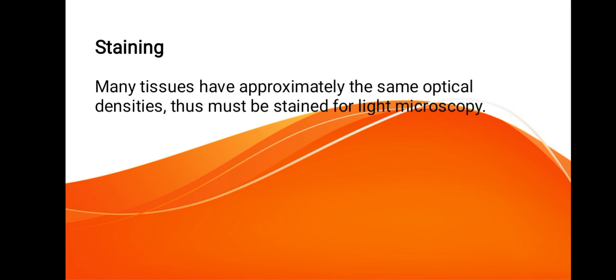This is usually accomplished by passing the slides together with their mounted sections through xylene or toluene to remove paraffin, and then through descending strengths of alcohol to water, as most of the dyes used are in aqueous solutions.